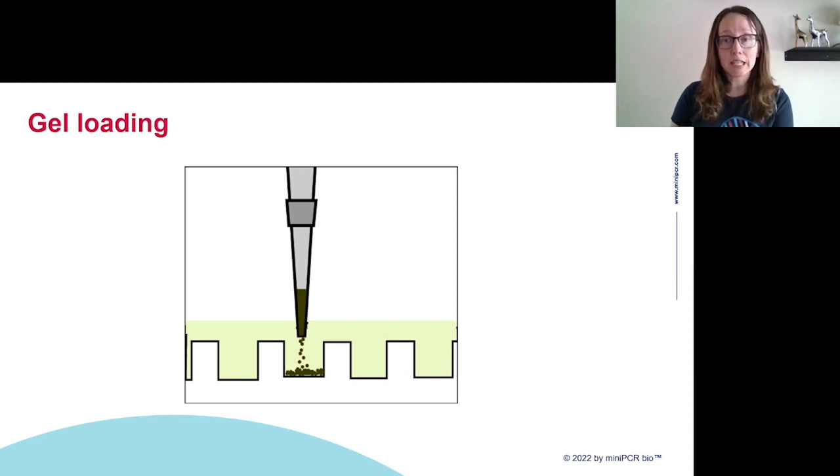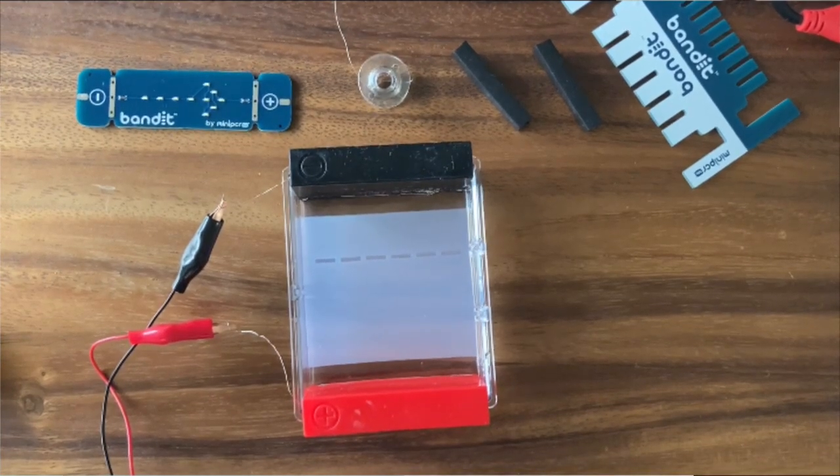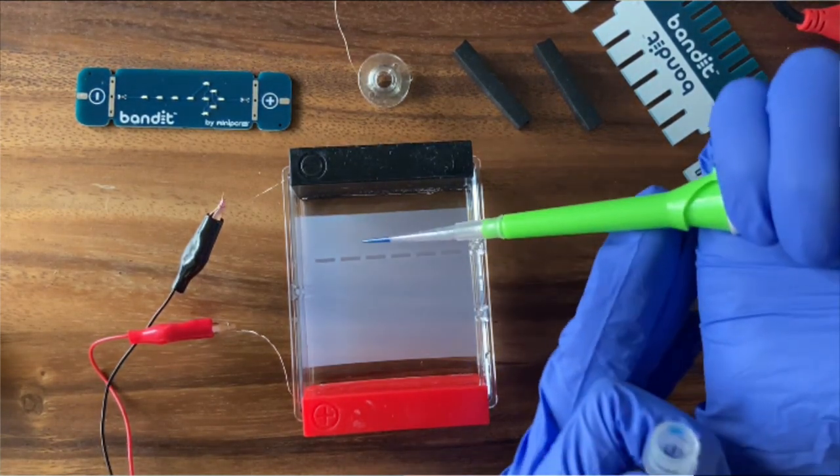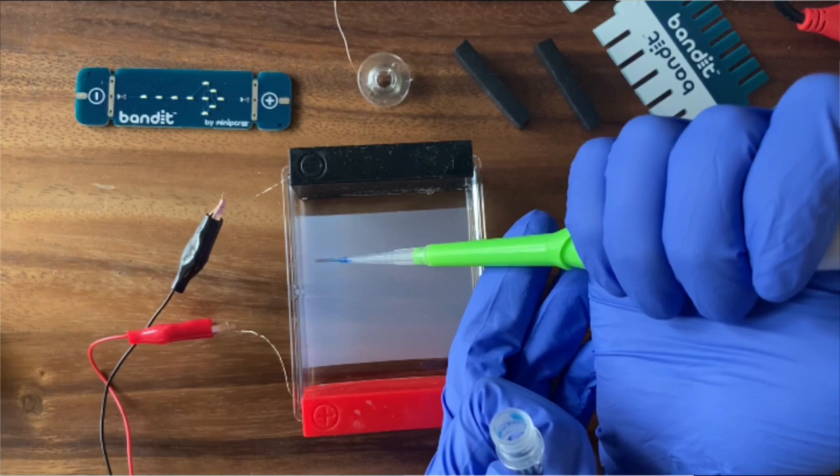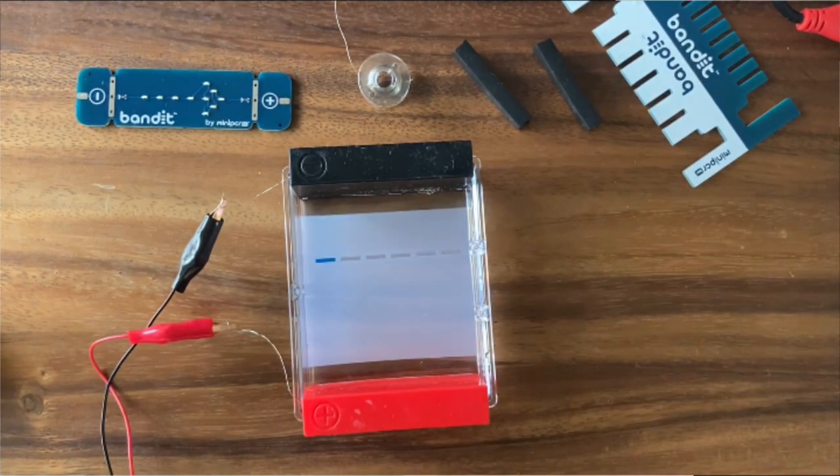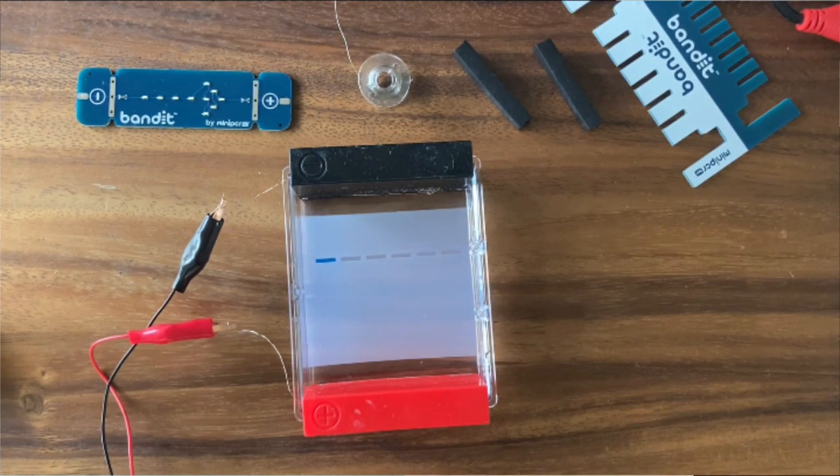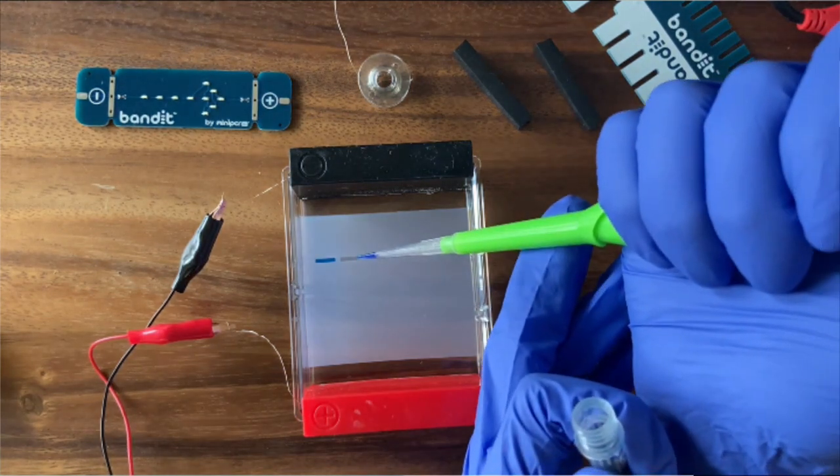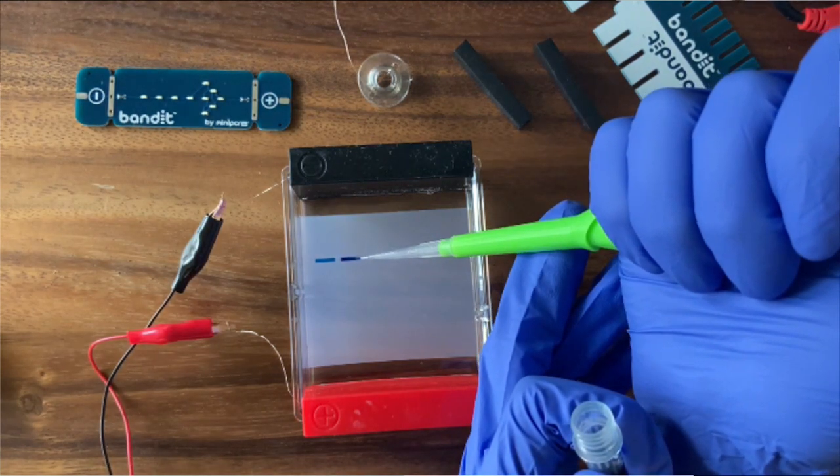Let's take a look and see this happening in real time. I'm about to load my gel. I'm going to put my samples in the wells of our gel, and then once we turn on the system, we'll see how they migrate through. I'm going to load our gel using a micropipette that's going to pick up 10 microliters of my samples and load them into the wells. This is a 10 microliters fixed volume micropipette that we sell at Mini-PCR. It's really nice for classroom use. You don't have to set the volume, so it always picks up 10 microliters.